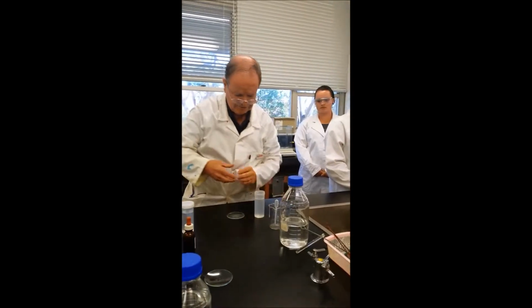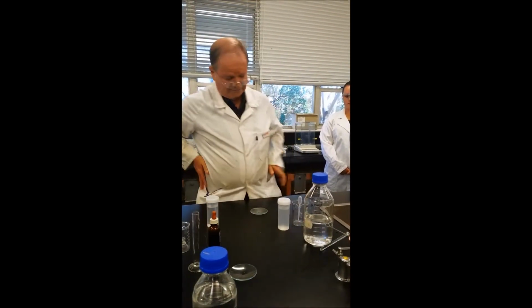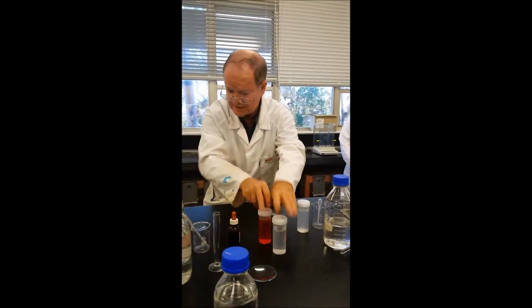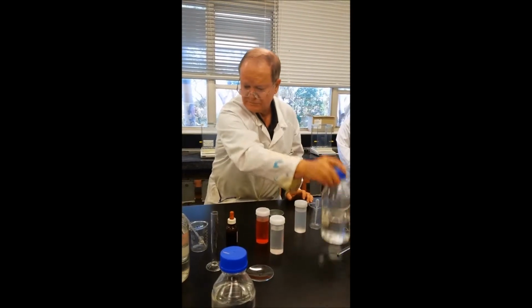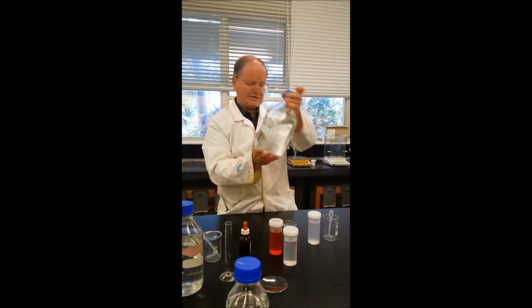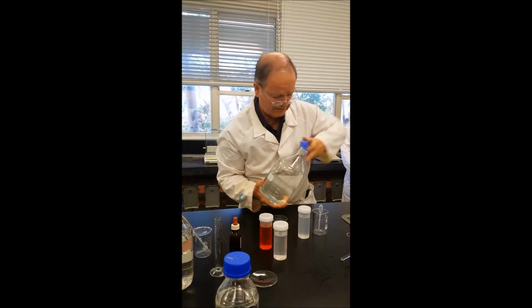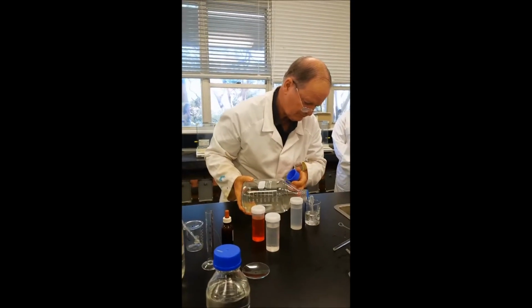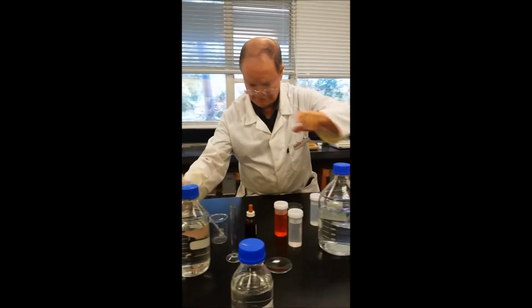So you have to do this individually, so everybody actually has to do it. Because you have to have your own, and you have to test it. Alright, well, put the phenol down there. Now we've got 0.1 molar HCl. We've got that around the wrong way. So the HCl goes over here. You pour some out into this. And on the right, we put the NaOH.